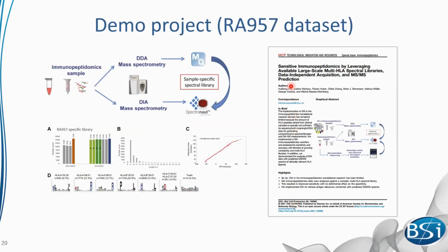Our demo project is built from the dataset from this paper in 2021 from the research of Switzerland. In their paper, they built the DDA dataset and the DIA dataset from the human cell line and processed them with different software. We picked one of the datasets, the cell line RA957, to analyze in our workflow.